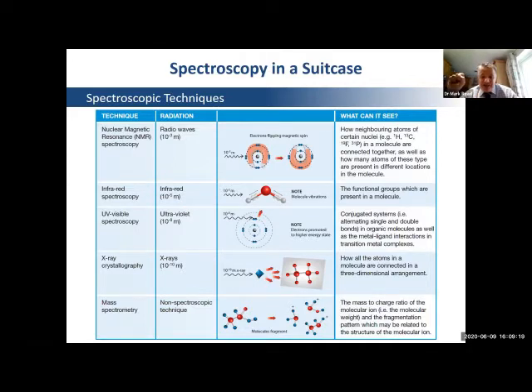And by the time we get up to X-rays, the wavelength is so small that they're actually diffracted or bent by the very small distances between ions in the crystal. They produce a pattern, you interpret that pattern, and that's where you can work out the structure of crystals. That's how DNA, for example, had its structure elucidated, and we still use it today for important ceramics to work out the structure. Everything from semiconductors, electrolytes, new battery materials, very useful techniques.